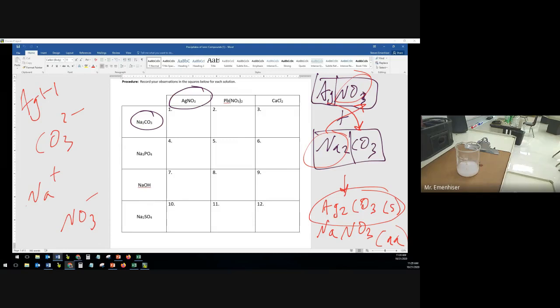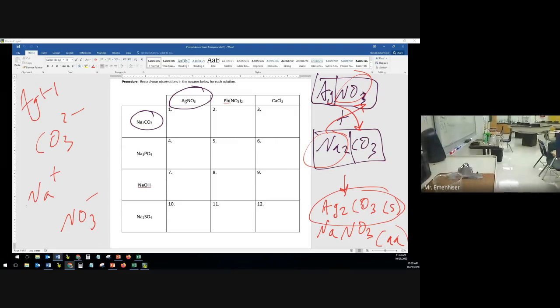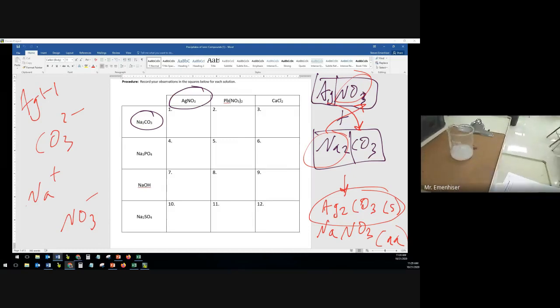But the point is I made all of the solutions in that video, and I have them sitting over here. I don't know if you can see them, they're sitting on that table over there. There's 12 of them. And so what I'm going to do now is grab this one, and I'm going to pour off the liquid, and we'll see if we see a solid that is left over from yesterday.